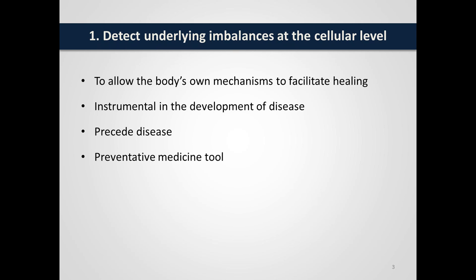This means that as practitioners, we have a technique here that is truly valuable in preventative medicine, because we're able to identify imbalances at an early stage before the onset of pathology and take the necessary steps to reverse the process. Most other so-called preventative measures in conventional medicine are only really early detection measures, as they detect imbalances brought on by pathological processes that have already taken hold.